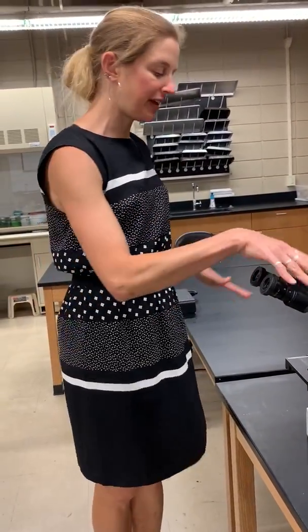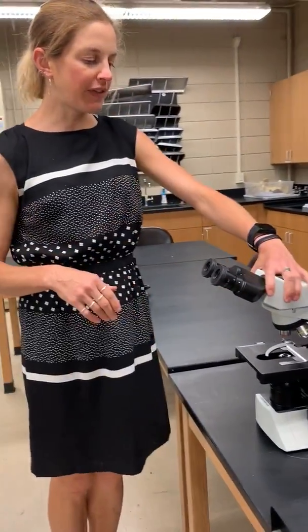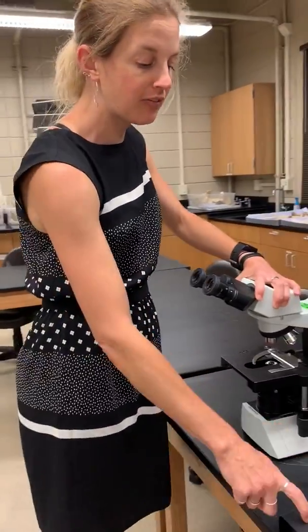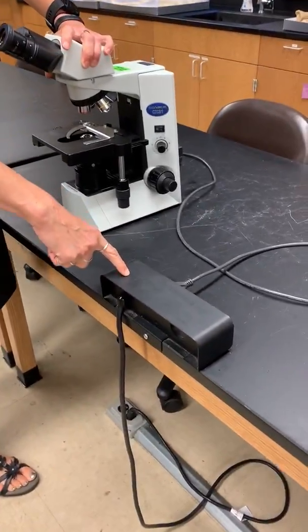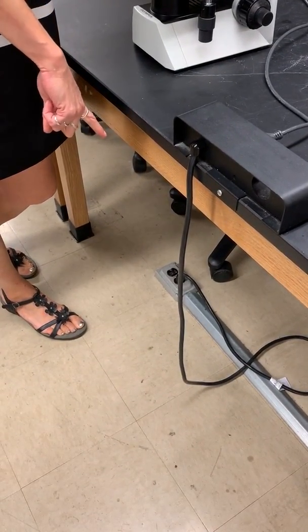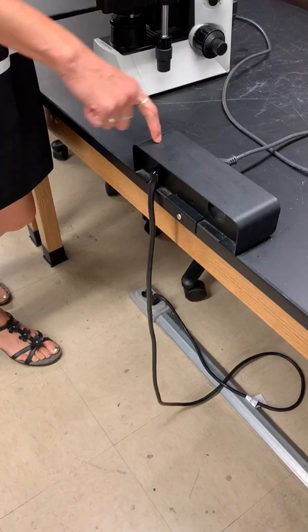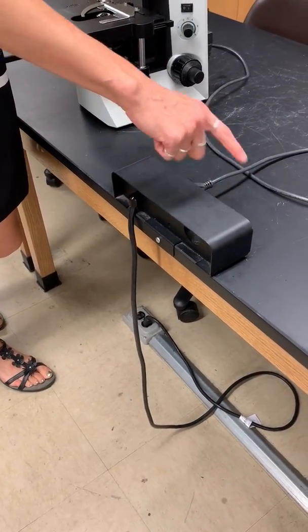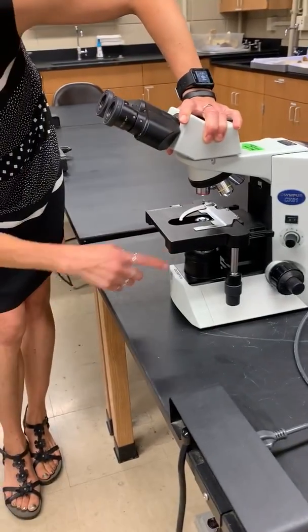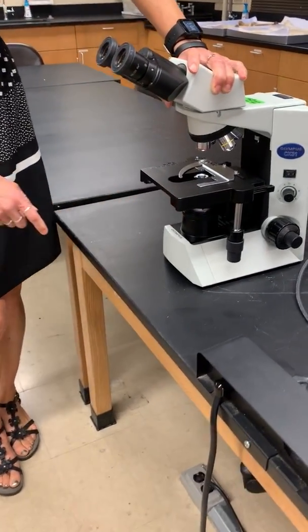I wanted to go over a couple of microscope things with you guys. One of the first things to do with your microscopes in this lab is to make sure they're plugged in. You've got these things on your benches, and you want to make sure it's actually plugged into a socket on the floor. If one doesn't work for some reason, just try another socket. You should be able to plug it in and turn it on, and you should see a light coming out of the light source.